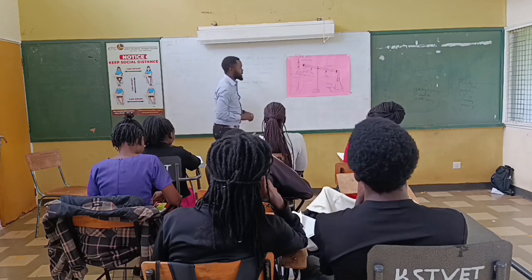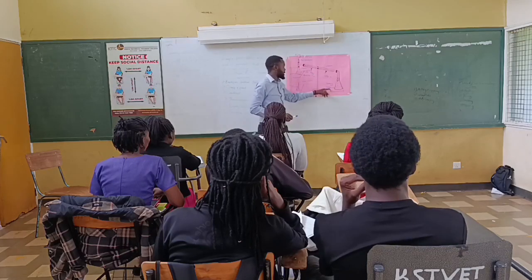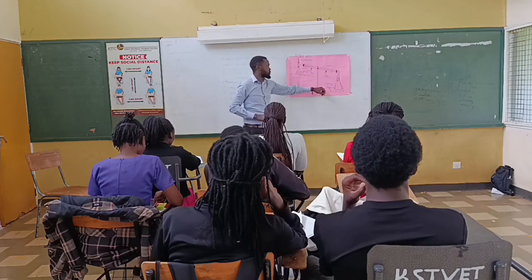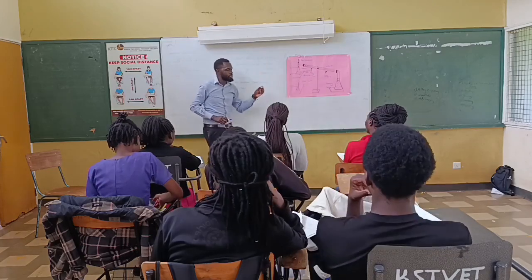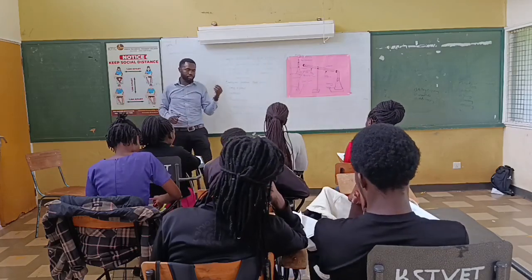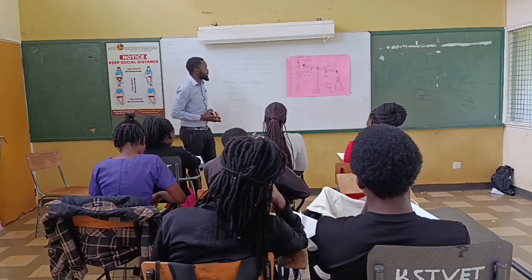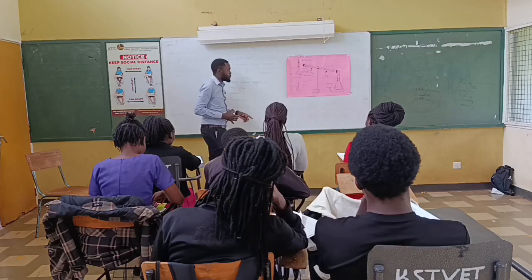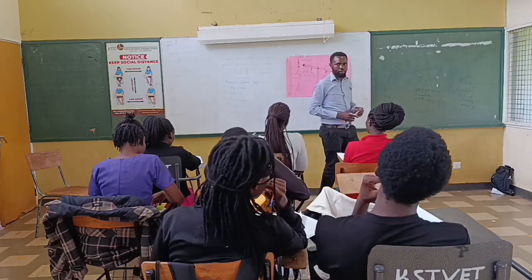So we generalize it as the receiving flask. But then in here we can see this liquid is being referred to as the distillate. The distillate is that which evaporates fast. Okay? Now, with that, separation shall have been achieved because the one with the low boiling point will evaporate out fast.